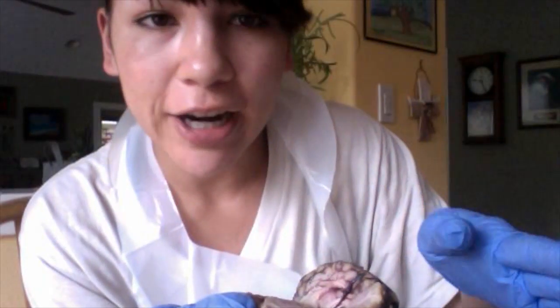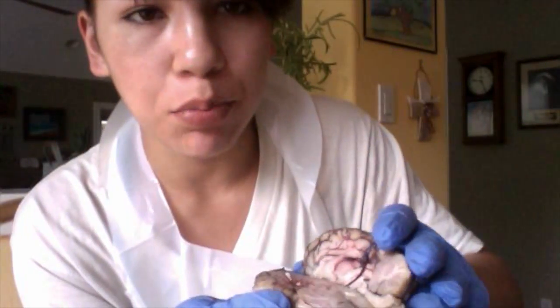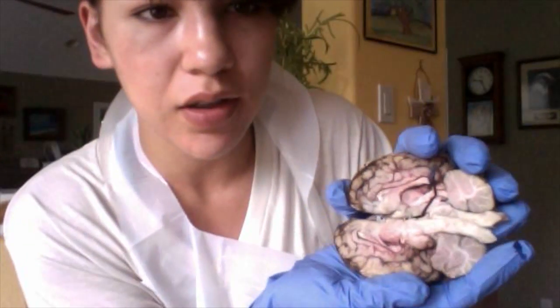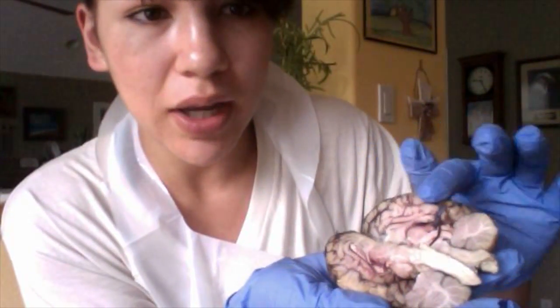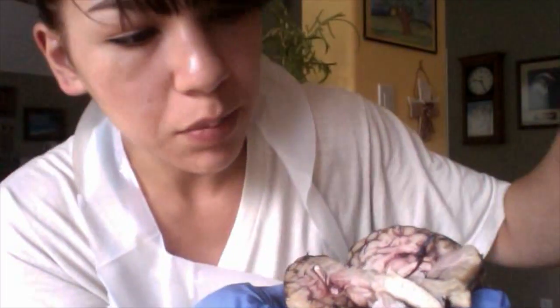All right. And finally, to wrap this up, we are going to look at the sagittal section of the brain. So I've already split the brain along the longitudinal fissure that separates the right and left hemispheres, and we have an image that looks like this when it's split in half. So here we have the cerebrum up top, the corpus callosum, let me get my forceps.